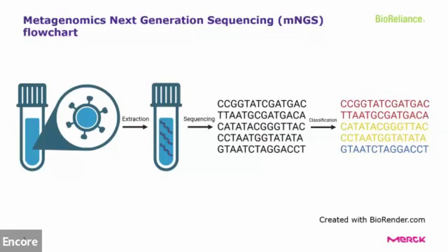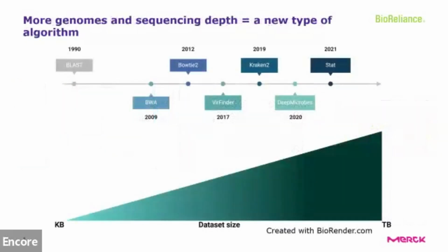So we already have a pipeline, the previous pipeline. So why are we moving to a new algorithm if we already have one? Especially clients are like, why are you changing the algorithm? So there are multiple reasons for that. But one of the biggest ones is that the growing volume of data has driven the development of smarter algorithms.